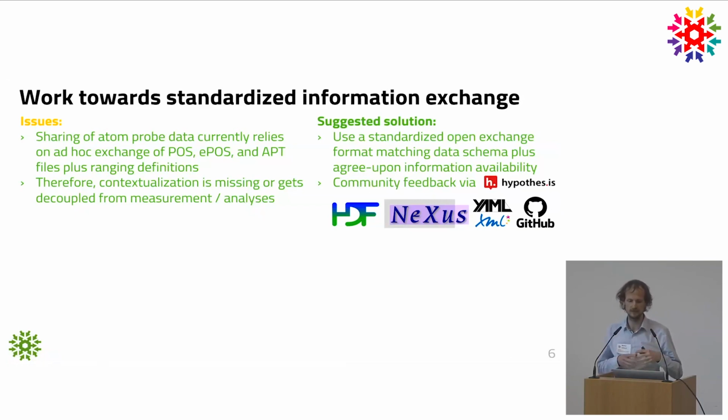That means basically criteria that say, okay, this piece of information should be there, this information is required, and everything else is optional. And most of the fields are in fact optional because we don't want to be super restrictive. But it's also clear that when you set no rules, you cannot expect the software to do anything with the data set, because somebody could just upload something which is empty, and what would you do with it? It's obviously useless. But there are also more subtle cases where you could prove such an algorithm wrong if you always claim we don't need to set any rules with people. It's not the way it works, and I'm not convinced that's the way it will work in our case.